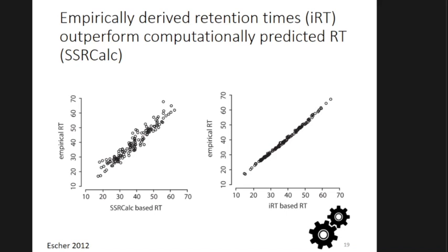So very useful, but Brendan will walk you through specifics. Just to expand on that a little bit more. For example, our biggest problem is the columns that we use, and to switch those, we have to run it on a new column. You would run this again on your new column, and I have an example of what that might look like.